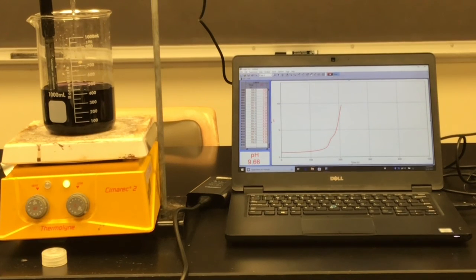Is it just going to keep going up and up forever? Keep in mind that the graph is a little behind what's happening for real over there. But now you'll notice that it is starting to level off a little bit. And as it levels off, it's slowing down. So we didn't end up with a straight line at all. We ended up with an S-shaped curve. And the S-shaped curve is called the titration curve.